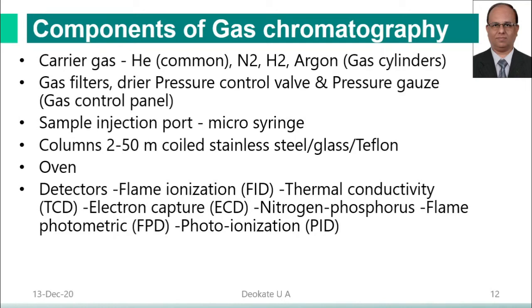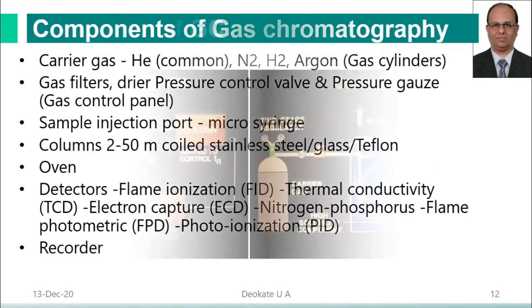Then the detector. Various detectors are listed here, such as a flame ionization detector, thermal conductivity detector, electron capture detector, nitrogen phosphorus flame photometric detector, and photoionization detectors. And the last component of the instrument is the recorder.